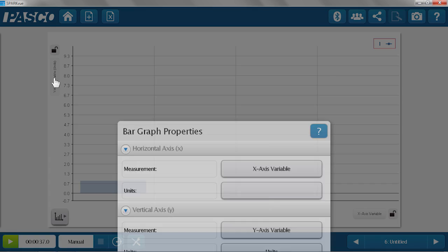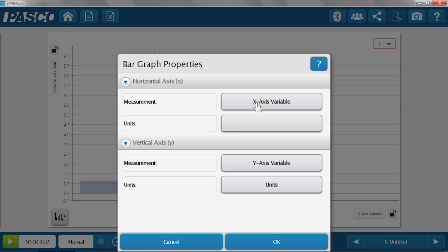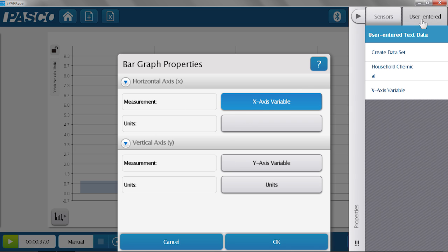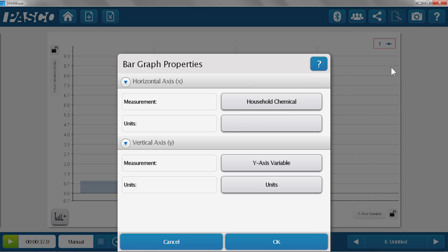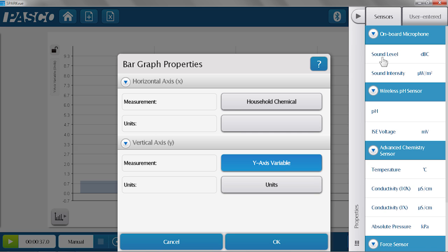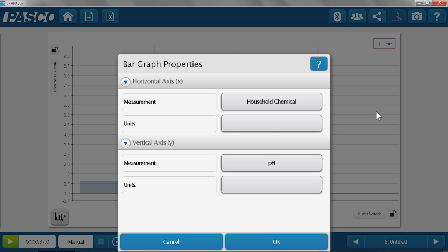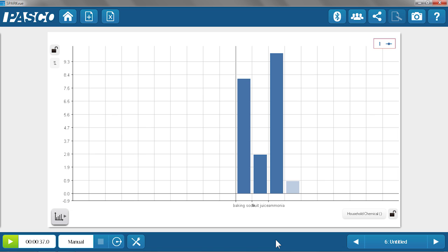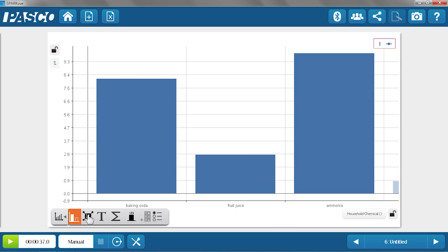And now I need to assign those axes. So I'm going to click on one of the axes and my x-axis I'm going to make the household chemicals that I added. And my y-axis I'm going to make the pH. I'm going to hit OK. Here's my bar graph. I'm going to adjust that a little bit so I can see it better. And there we go. We have a nice visual representation for the students to really understand the pH of those household chemicals.